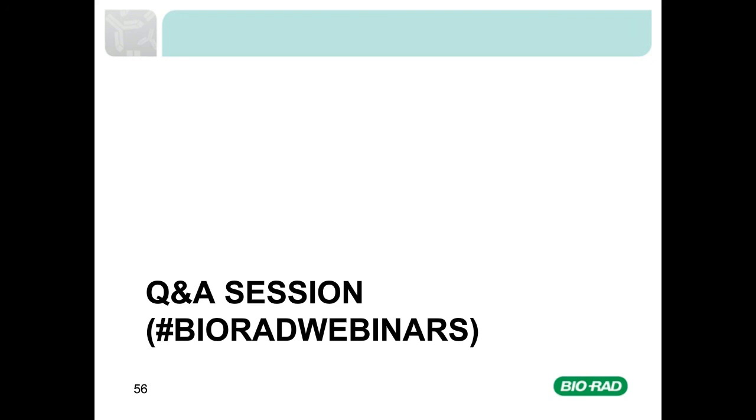Well, as you say, I would start with an SDS-based elution buffer, as this type of buffer is probably going to be the most efficient at eluting your protein off of the beads.